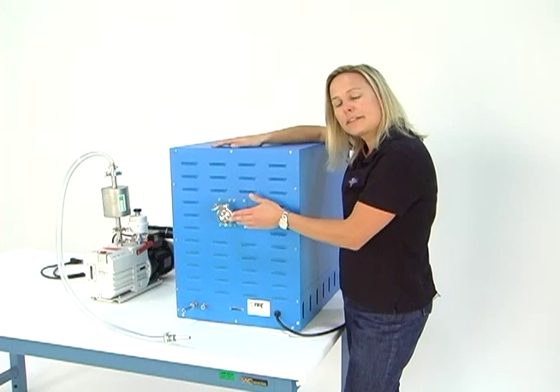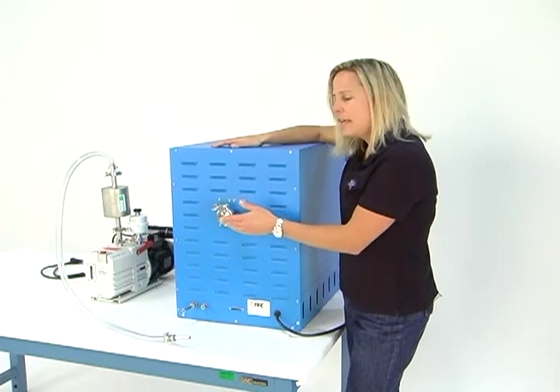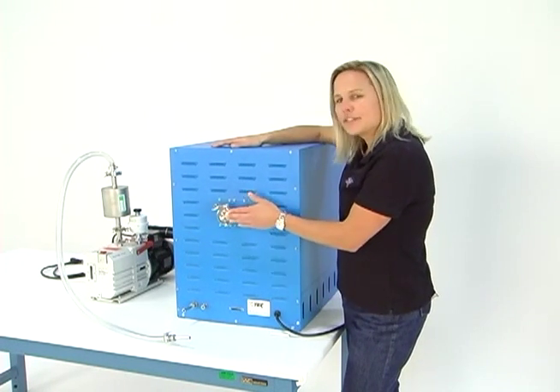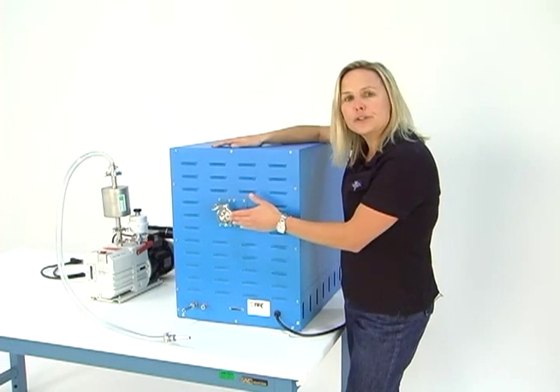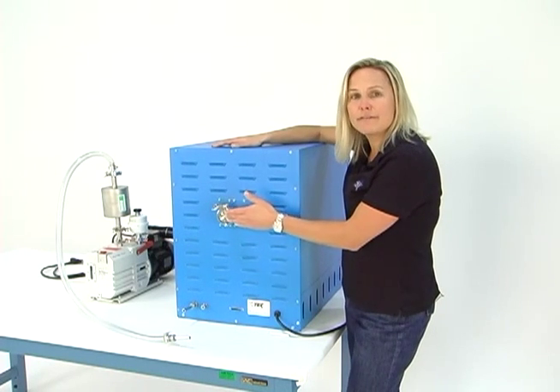Some people even want to connect their vacuum pump to this line. If you do, give us a call or send me an email, and I can tell you what you need to do to have this be your main vacuum port.